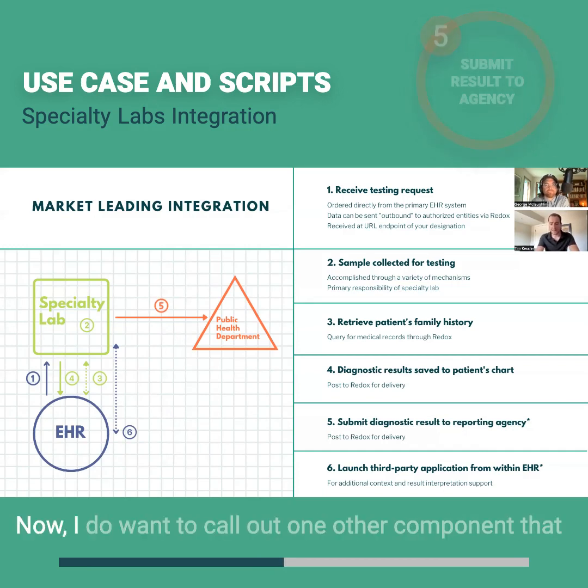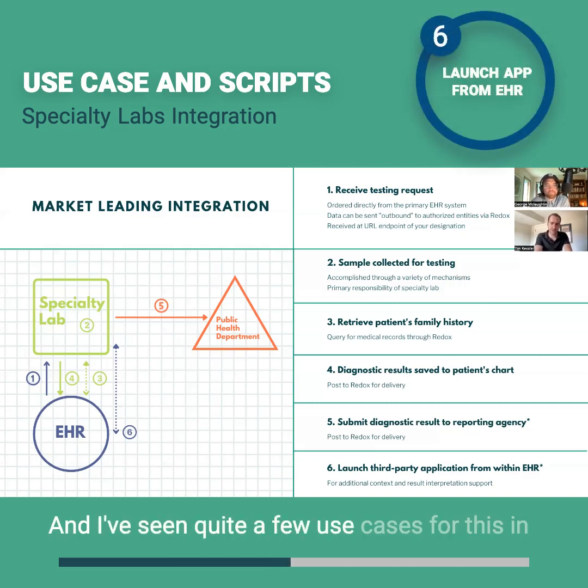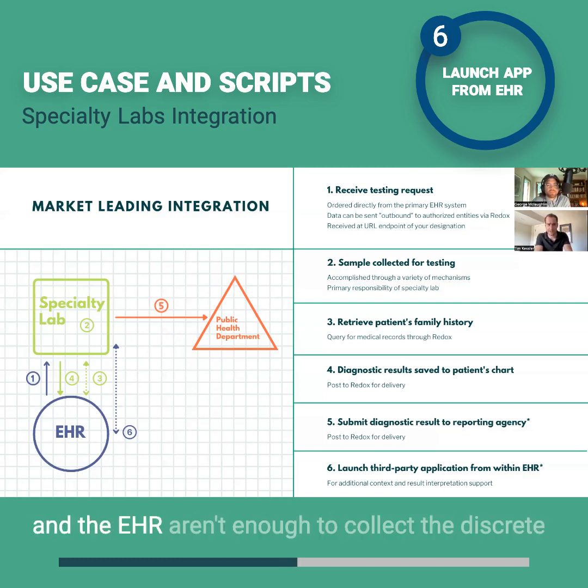Now, I do want to call out one other component that you could use to enhance this even a bit further. I've seen quite a few use cases for this in scenarios where, maybe, ask at order entry questions during the order placement process in the EHR aren't enough to collect the discrete data or the data that you're looking for in that specific patient.